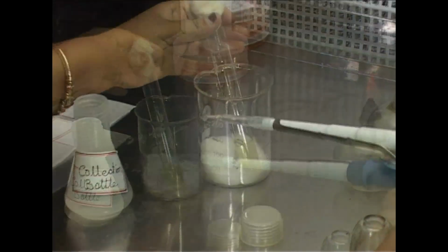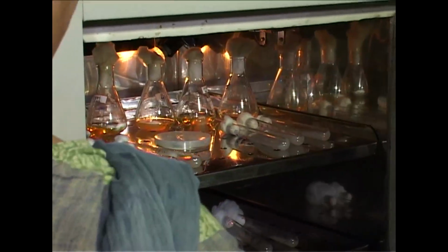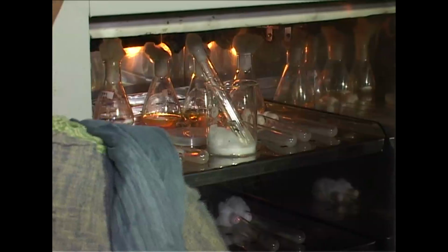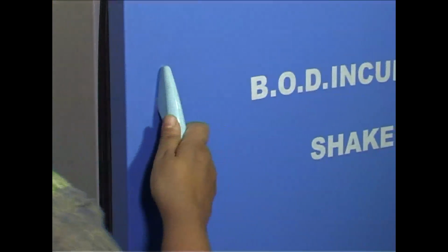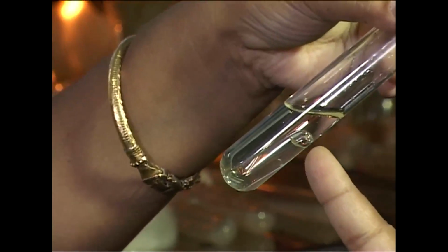I have already told you that the 5 basic sugars will be taken, like dextrose, maltose, sucrose, mannitol, lactose, etc. 0.2 ml of the culture will be added and all sugars will be incubated at 37 degrees centigrade for 24 hours. You can follow acid production by the change in color of the broth, and gas production by bubble production within the inverted Durham's tube.